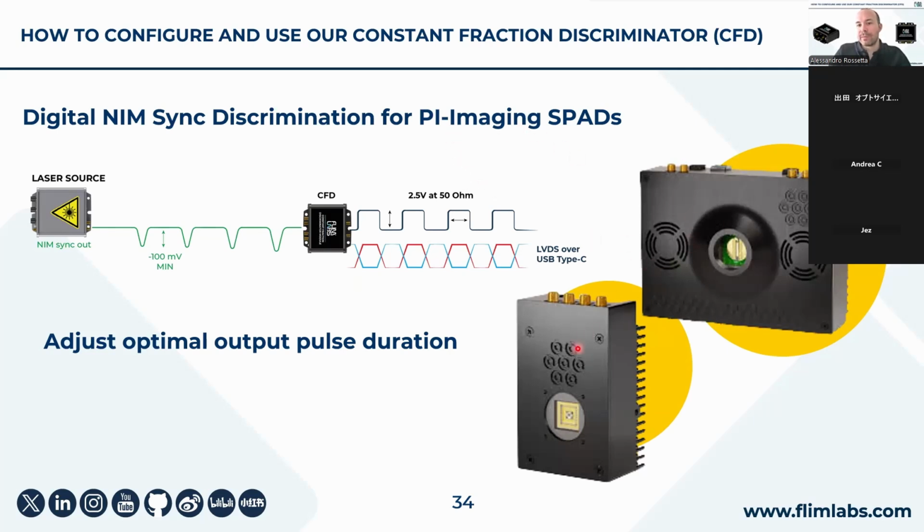So you see we have these two SPADs and they can work with a LVTTL with a specific output pulse duration. And our CFD is mostly used in conjunction with the two SPADs for accomplishing the discrimination of the laser sync so that the PI imaging SPAD can correctly see the laser sync.